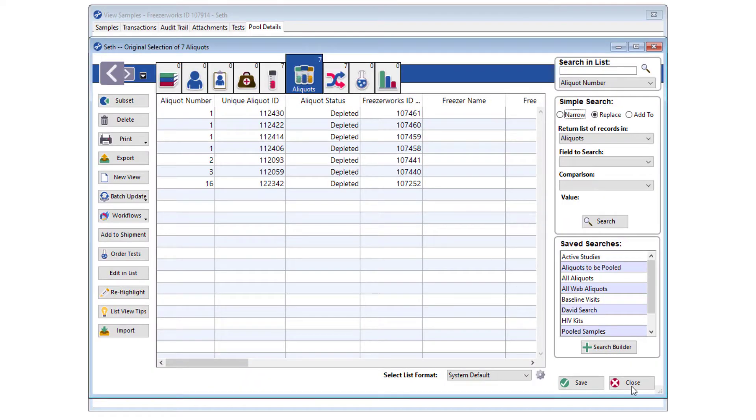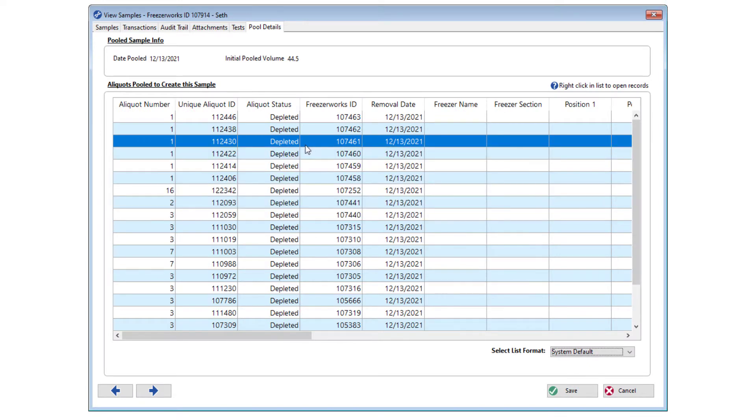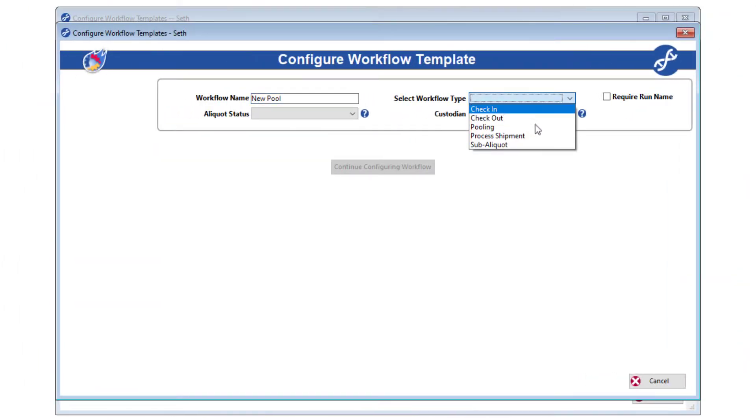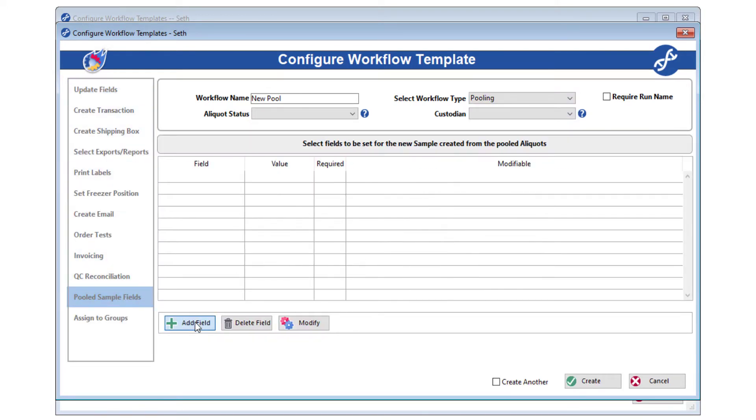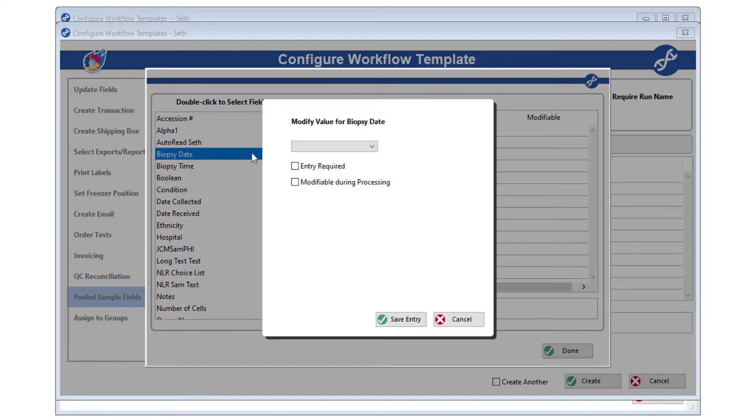Therefore, we determined it was time to bring it to FreezaWorks, and workflows seemed like the perfect place for it. As you may know, workflows allow you to create a predetermined set of activities that users can run on different selections of aliquots in FreezaWorks.